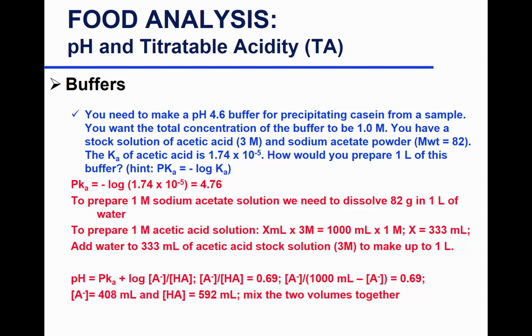So this is the way you're going to calculate it for the lab. But the lab asks you for 250 milliliters, so different volumes. Make sure you read that and calculate according to what's in there: 250 milliliters of 200 millimolar. So it's slightly different concentrations and volumes.